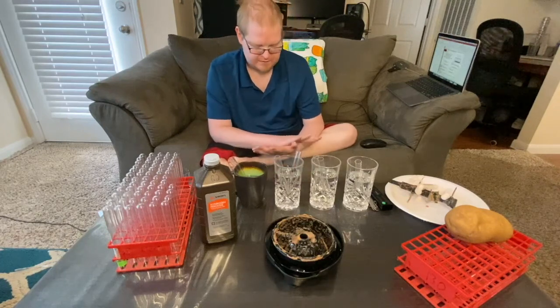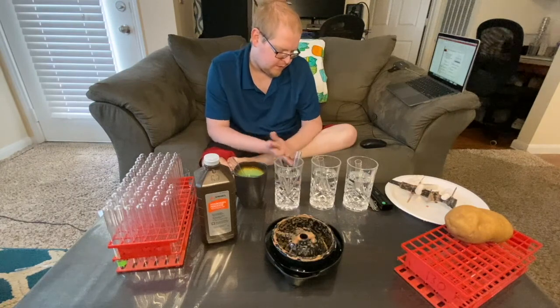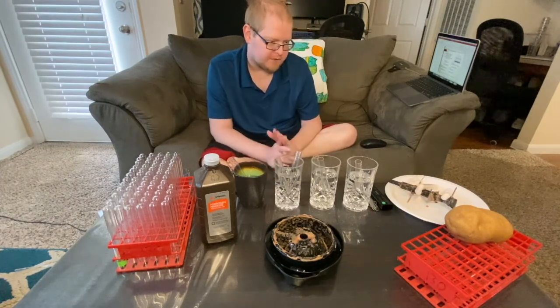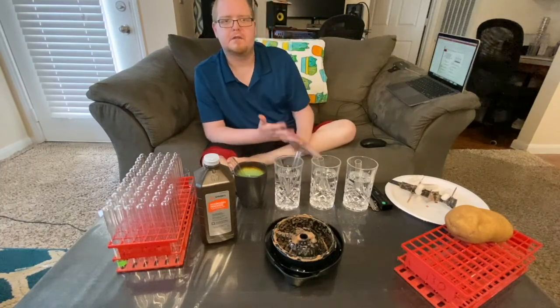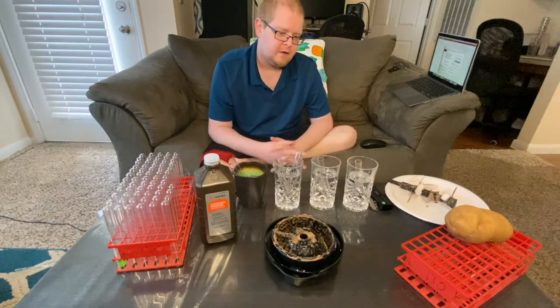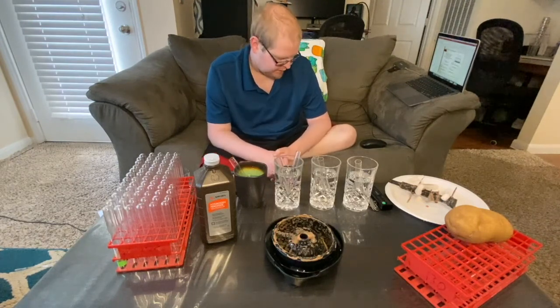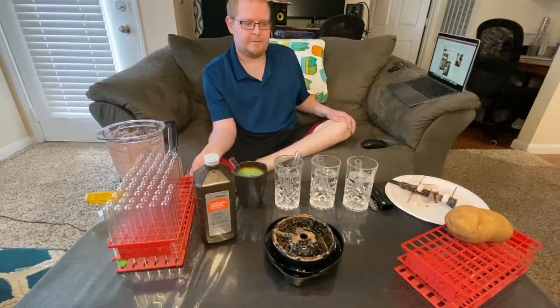Also, this is hydrogen peroxide. It is probably going to lighten your clothes. It's probably going to stain other things. So make sure you do it in an area where you don't have a whole lot of things to destroy. Okay, thank you very much.